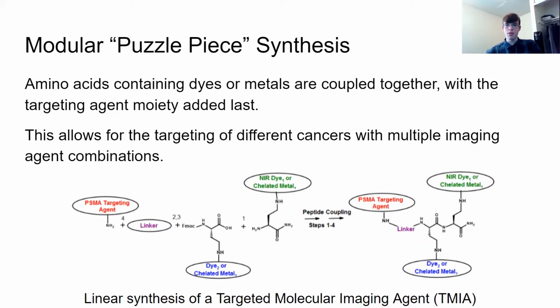We have two different peptides containing different dyes or metals that are combined with the linker and linked with the targeting agent. And in this case, this synthesis describes one for prostate cancer because it's the PSMA targeting agent.